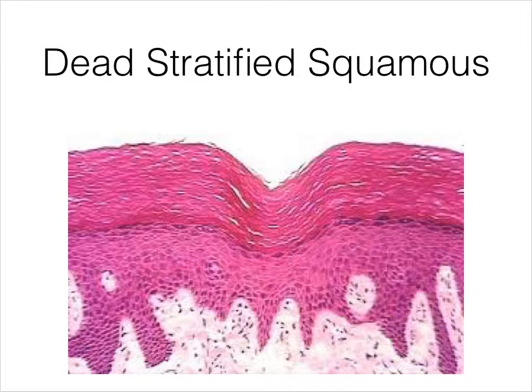These are dead keratinized or keratinized stratified squamous epithelium, at least these up here on the top are. Down here, this is the stratum granulosum, stratum spinosum, and basale, and these are clearly live cells. Now, dead stratified keratinized squamous epithelial cells are something that you are pretty exclusively going to find in the skin. And you guys have all studied skin. You know, generally speaking, what skin looks like. So one of the first things that you should ask yourself is, does this look like skin? And if so, are these dead keratinized cells on the top?